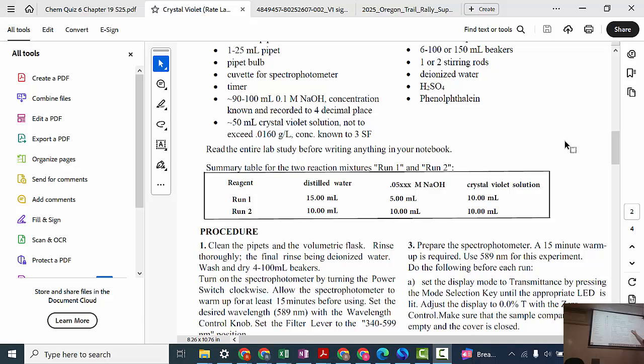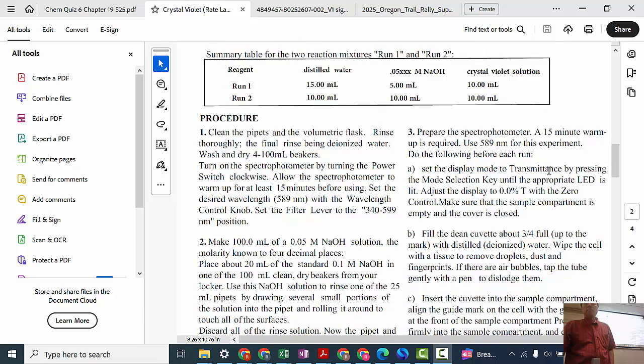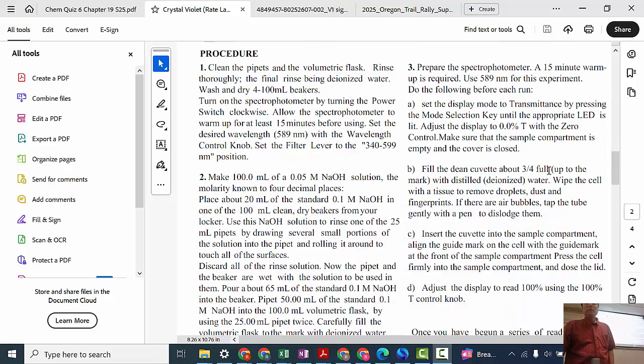So if we increase the concentration of the sodium hydroxide, does the reaction speed up, slow down, or stay the same? So that's what we want to observe. It actually speeds up here, so we'll see that. And so we'll do the data collection for this.